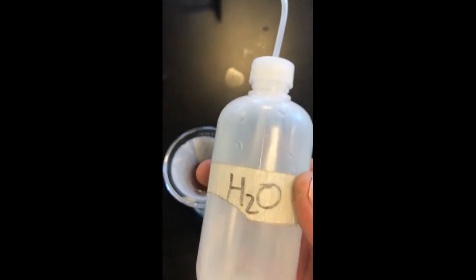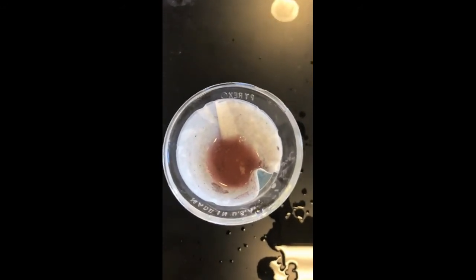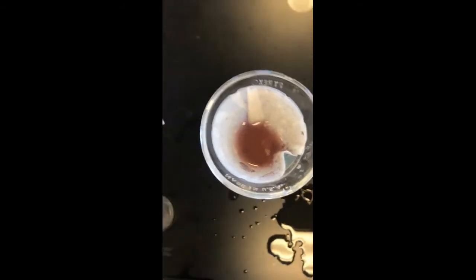When I was trying to get all of the solution out, I made sure that I took all of my H2O and put it into that and tried to get every little bit of that solid product formed out, so I can see how efficient this actual reaction was, and I can mass this out.